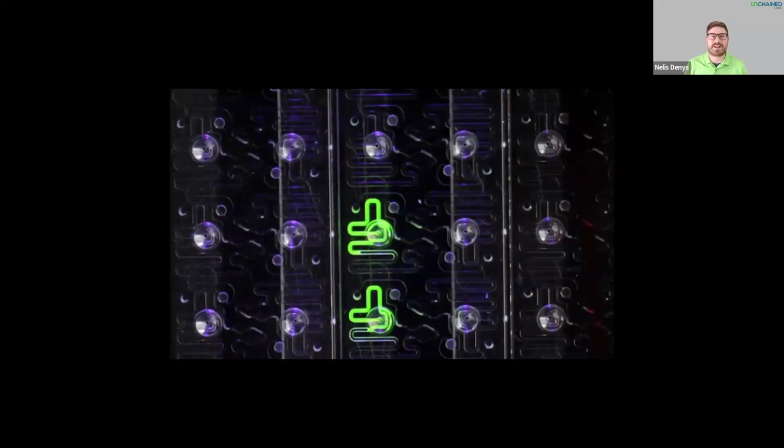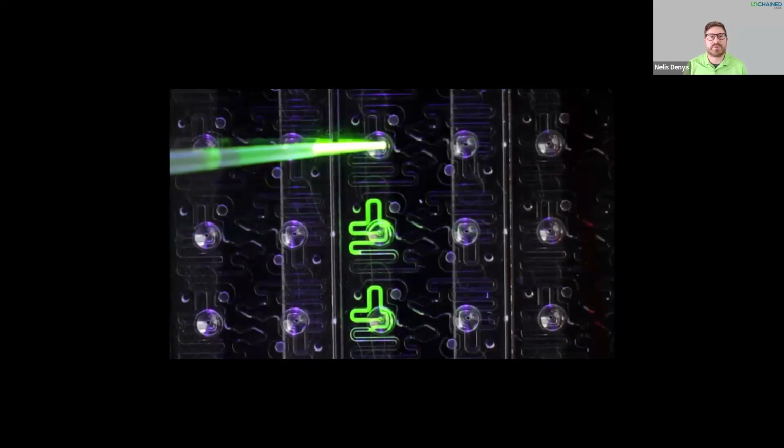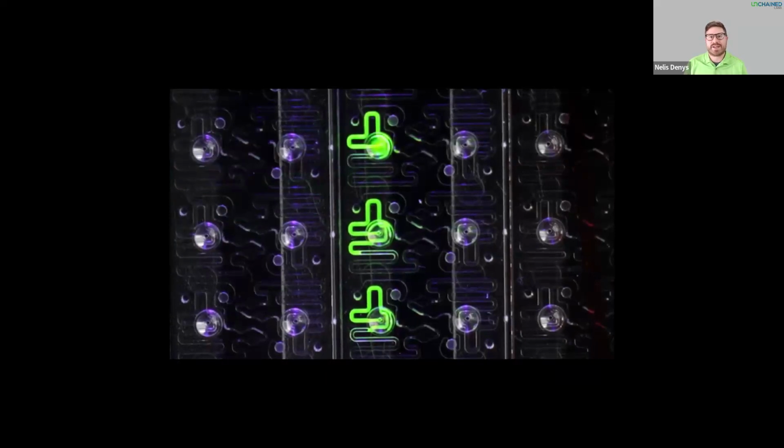Now here we can see exactly what sample loading looks like with the help of some fluorescein and a black light. In 2 wells, you can see that there's already 2 microliter of sample loaded. Now, if we want to load another sample, you see that you simply add in that 2 microliter into that input well, and the sample wicks into the plate.